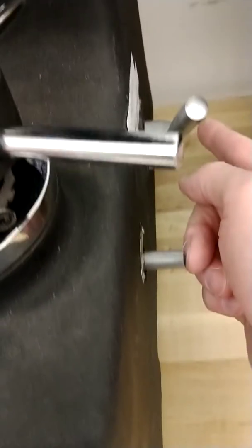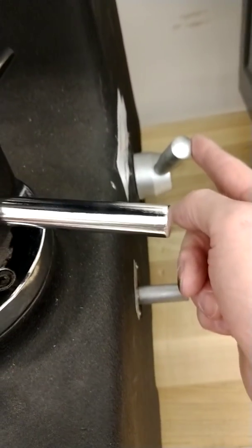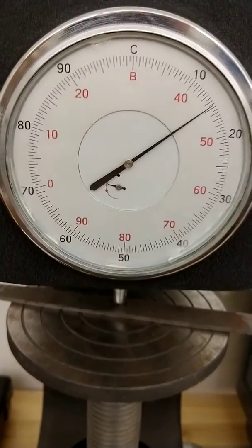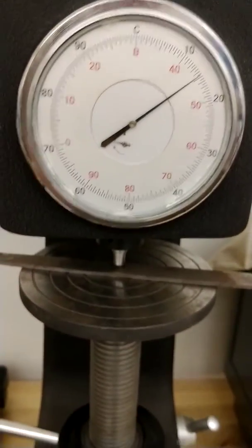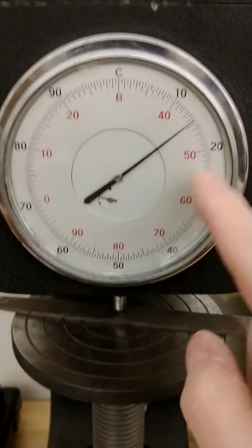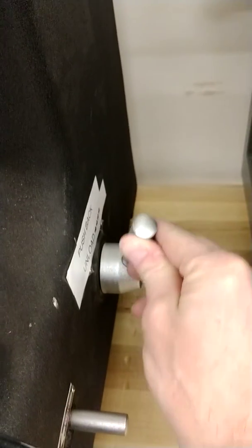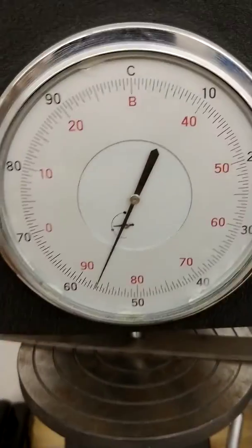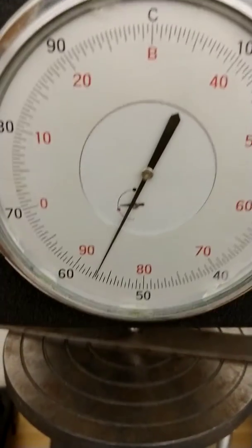When that knob has come all the way forward, that's my reset knob. When it's all the way forward and the dial stops moving, that means the major load has been applied. Now I need to release the major load so I can take the reading on the dial for the hardness — right now this is not the hardness reading. I'm going to push this lever back, which pulls the weights back up so that the major load is removed. Now my hardness can be read directly from the dial.